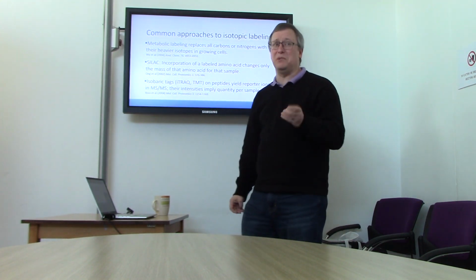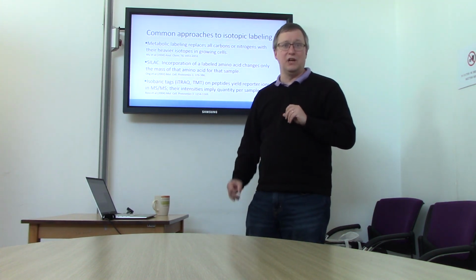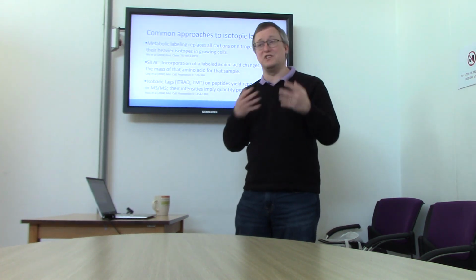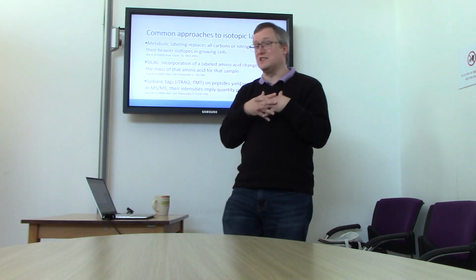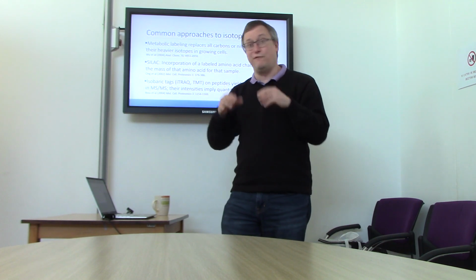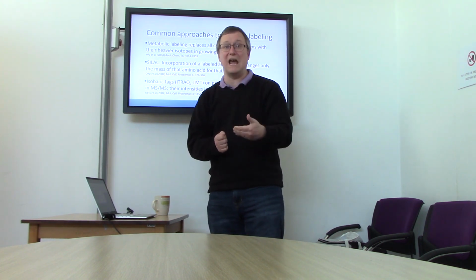But a very, very popular route is not an in vivo labeling at all. This isobaric tagging approach adds an isotopically labeled N-terminal prefix onto peptides, and we can use this to multiplex many samples in the same experiment. So a single LC-MS experiment will have 4 or 8 or even 20 different samples all multiplexed together, each with a different variant of this isobaric tag.